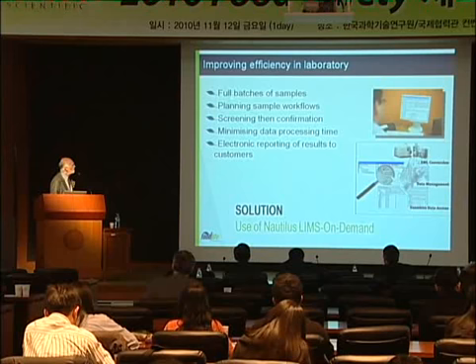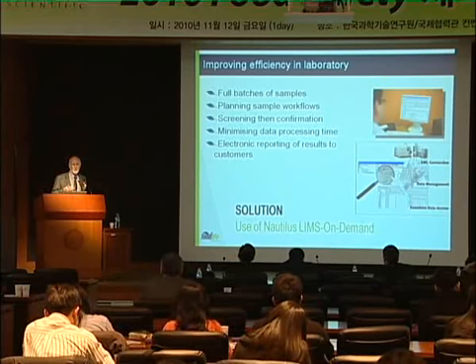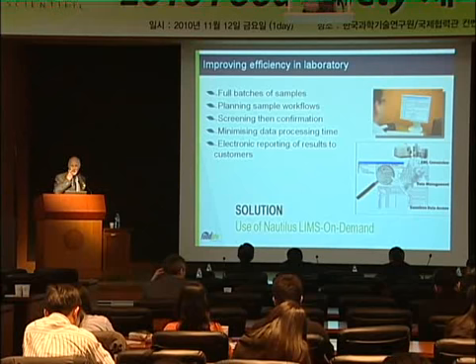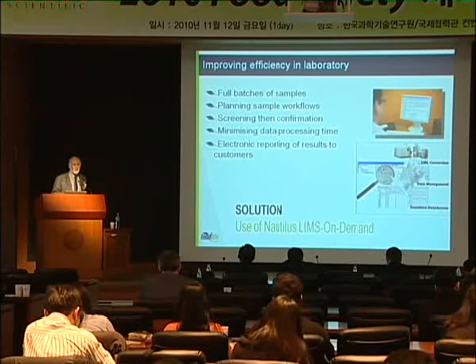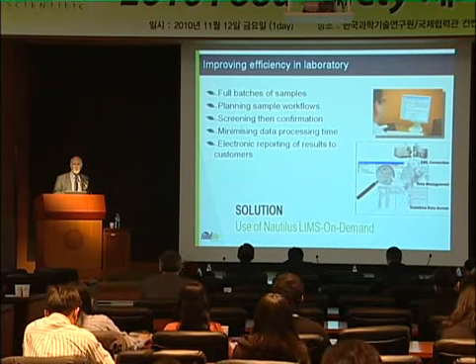You need to maintain full batches of samples. If you analyse a batch of only 10 samples when you can analyse 20, you're increasing the cost per sample because you've got calibration samples and blanks in that batch, because you've only got 3 samples perhaps that you're going to charge the customers for. So maintaining full batches of samples is important. Planning sample workflows through the lab is important. Some samples will need screening before they then go on to confirmation. Some samples will go for multiple analytes. You may be doing pesticides and mycotoxins on some samples.